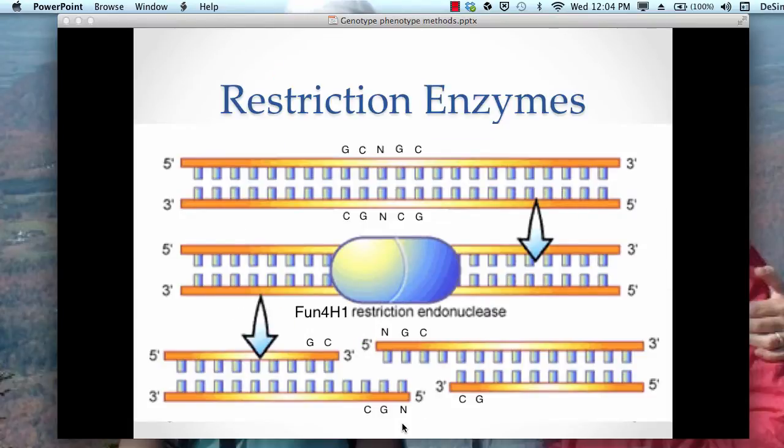Now we're ready for the RFLP part. Restriction stands for restriction enzymes. These proteins are found in bacteria and act as a bacterial immune system. Their job in bacteria is to chew up any DNA from an invading bacteria or virus, thereby rendering that invader harmless. Molecular biologists have hijacked these enzymes for use as DNA-specific molecular scissors.